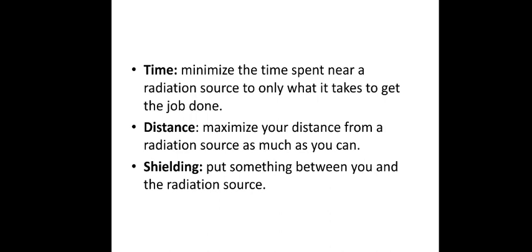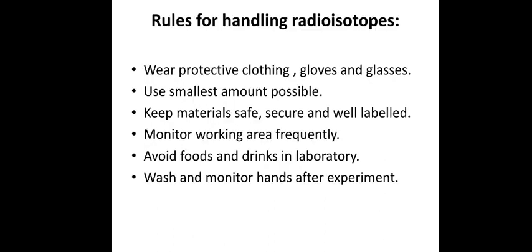Then distance: minimize the time and maximize the distance. The more the distance, the less you are exposed to these radiations. Then shielding: shield yourself by putting something in between you and the radiation. There are shields available which you can use, so that you are not directly exposing yourself to the radiation.